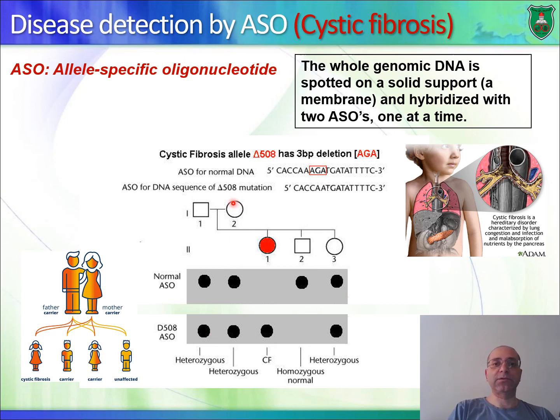Look at the mother now. There's a signal that is coming out when the normal oligonucleotide was added and when the mutated oligonucleotide was added.